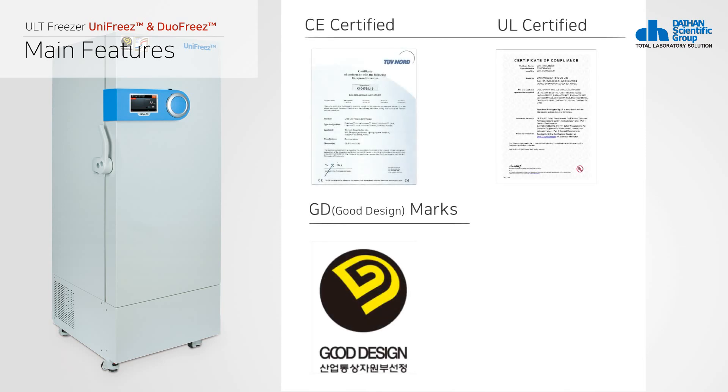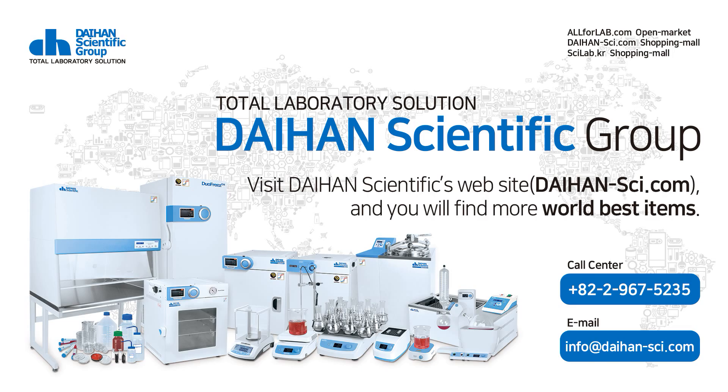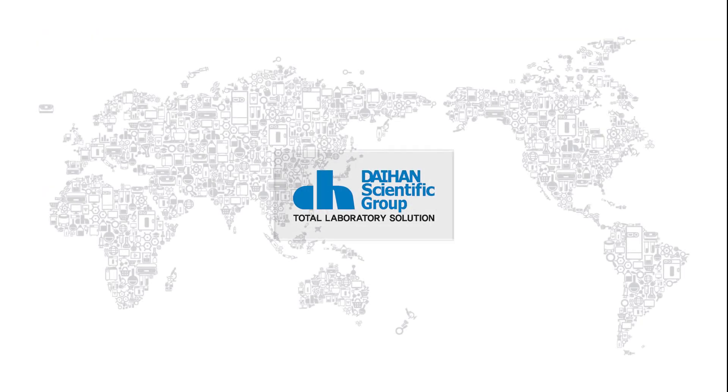Daehan Scientific's ULT Freezer has obtained UL and CE certifications, which are safety certifications in the US and Europe, and has been selected as an excellent design product. This concludes the introduction of the Daehan Scientific ULT Freezer. Visit Daehan Scientific's website and you will find more world-best items. Thank you.